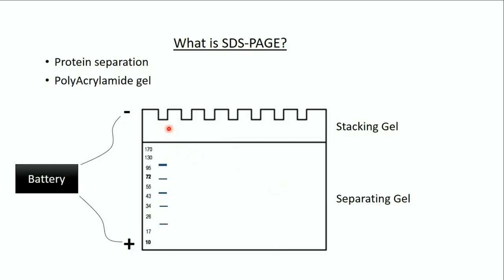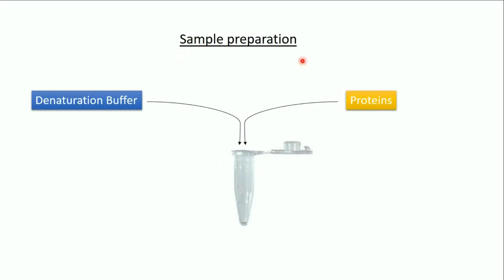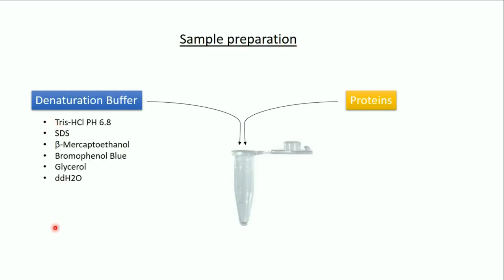First of all, to understand the principle of the SDS PAGE, we should speak about the sample preparation. In the sample, we have the proteins, and we also have what we call the denaturation buffer, or the sample buffer, or the Laemmli buffer, which is composed of several substances. The most important two materials of this are SDS and beta-mercaptoethanol. So I'm going to speak about them first.